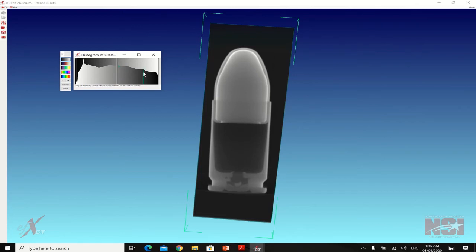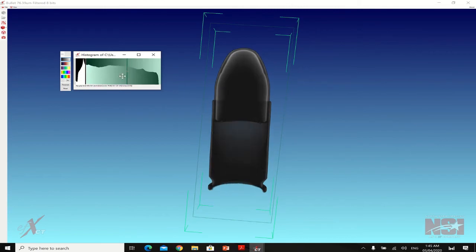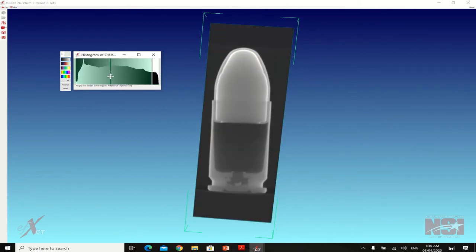If we hover the mouse on this window, you will see this kind of cursor, the four-sided cursor. This four-sided cursor can move what we call keys. Okay. So let's try. We click this one, then move either to the left or to the right. As you can see, something happens in the volume. This keys represents colors, which also represents the density, which also represents the material.